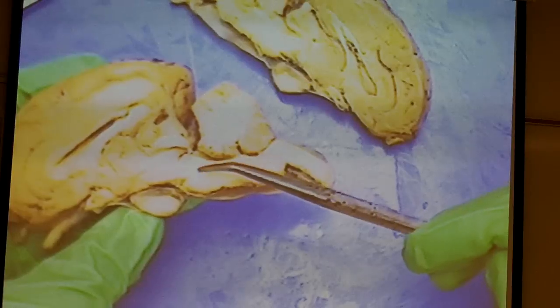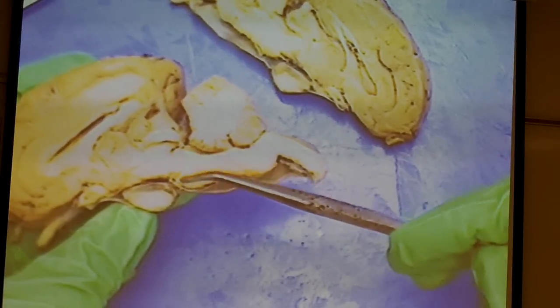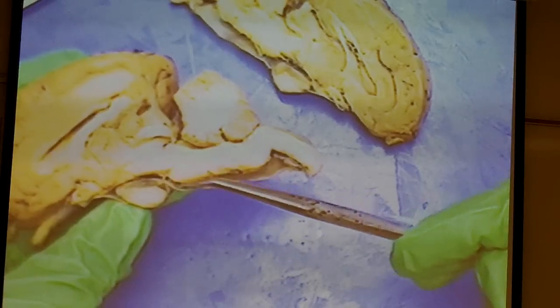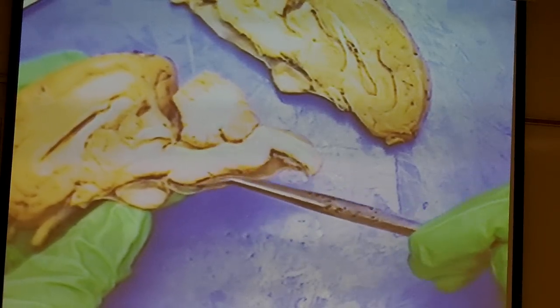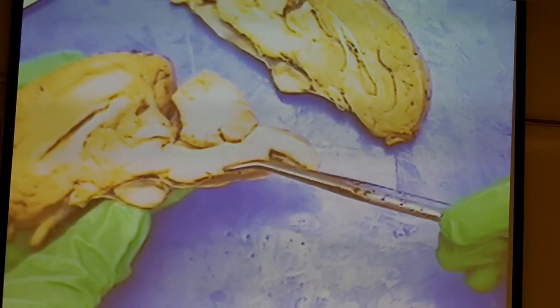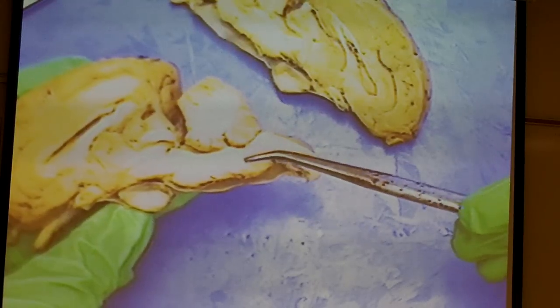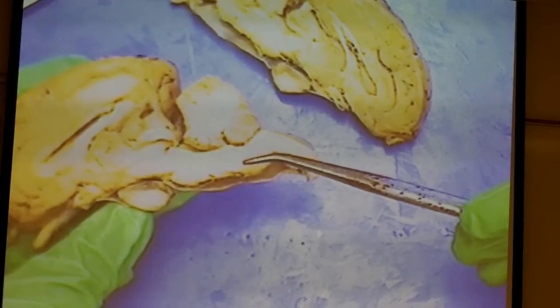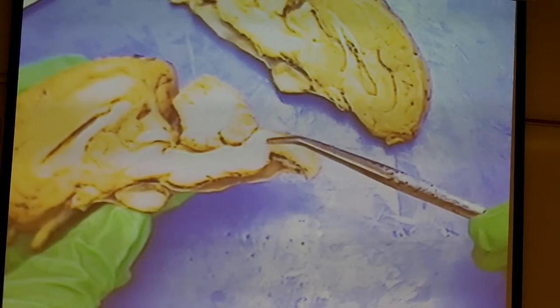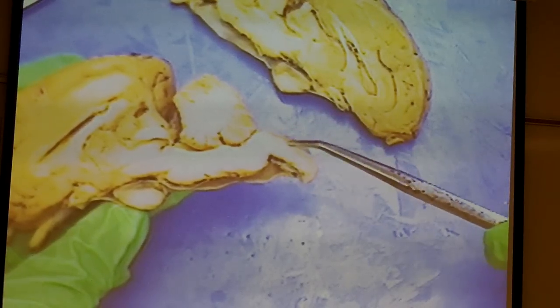The pons is important for micturition, helps regulate your respiratory rate by influencing the medulla oblongata, and is also important with sleep. Moving down, the medulla oblongata has the cardioacceleratory center, the cardioinhibitory center, the vasomotor center, and a respiratory center. The medulla oblongata continues inferiorly as the spinal cord.